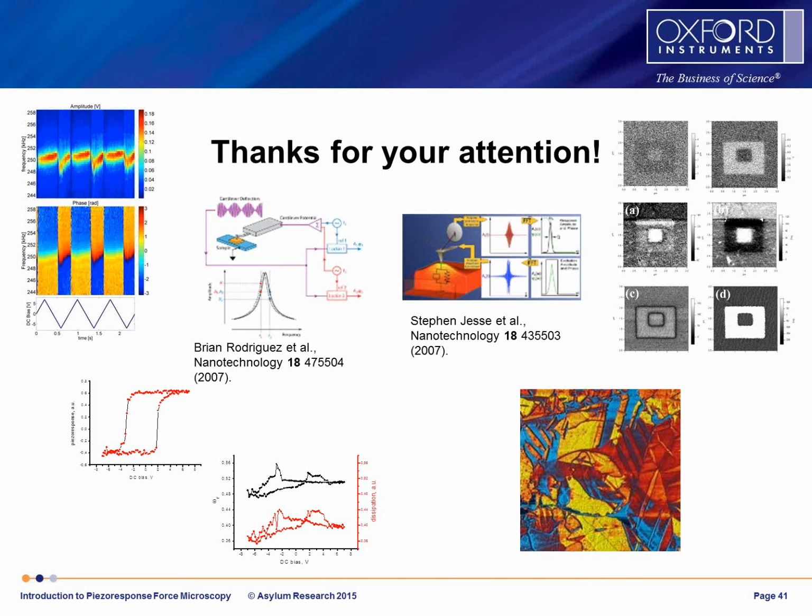Now, when we consider the contact between the cantilever, between the tip and the surface, these ions will be kind of sticking inside this gap because they're chemically bonded to the surface. Since they have different physical sizes, the effective field acting on material would be different for positive and negatively oriented domains. So at first glance, it sounds that difference in the chemical termination of the surface shouldn't really affect PFM, right? Because we talk about the difference in gap of order of tens of picometers, whereas our tip surface contact is about 5 nanometers.